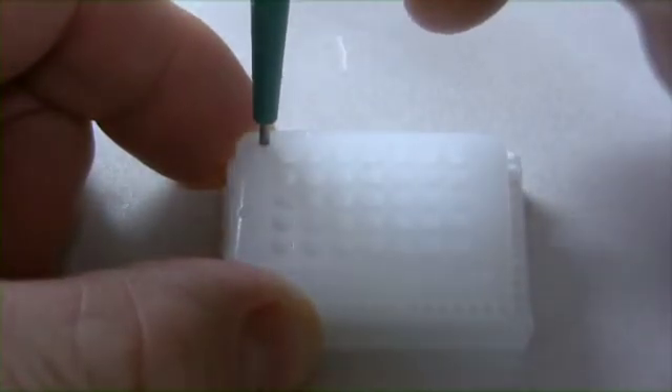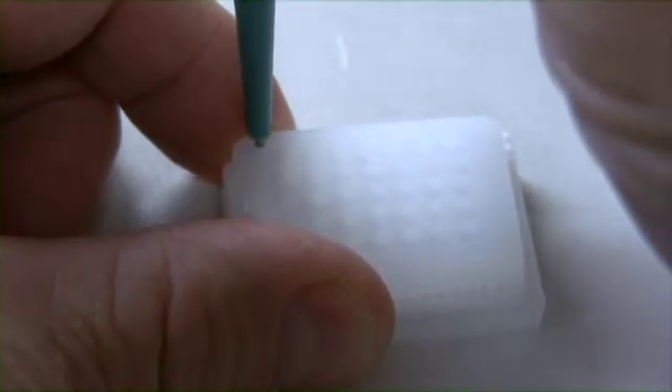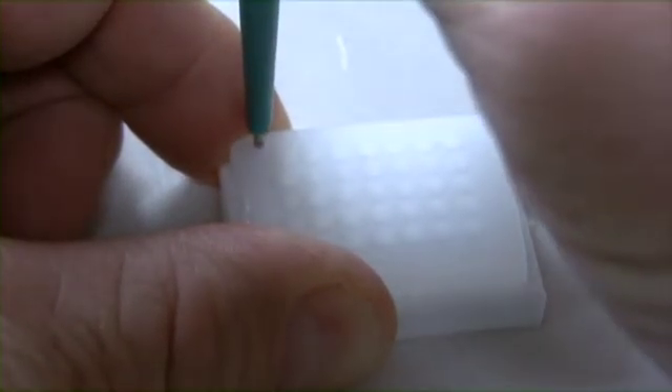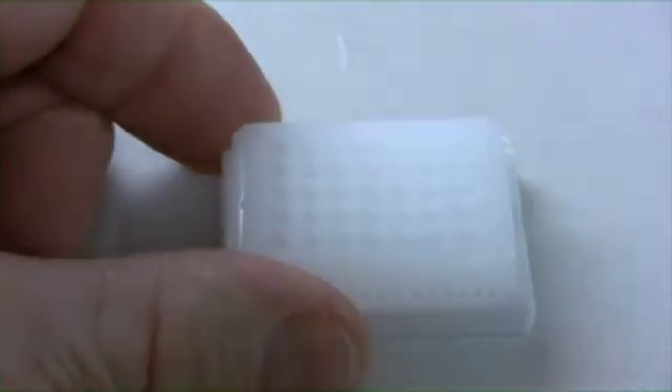Punch the array block with the 1 millimeter needle. The outside diameter of this needle is slightly smaller than the core size of the 1.5 millimeter needle. Try to make the diameter a little bigger, as I am doing here, so the punch from the 1.5 millimeter needle will fit. Be very careful because this is where you could crack the block.